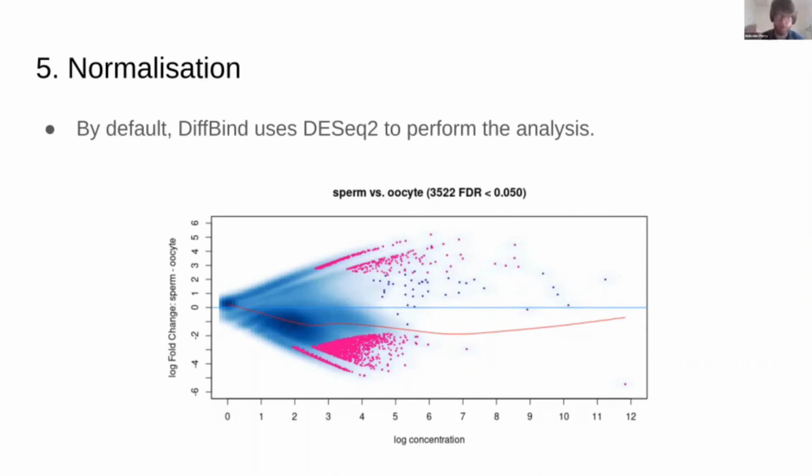And if you look at the red line, it's basically saying that at different concentrations, there are different normalization factors. And that's what's really tricky about this. In some experiments, stuff that's higher is amplified or suppressed, or stuff in the middle is too high or too low, and that kind of thing. So it is complicated, but we're lucky to have things like DESeq2 and edgeR to do this for us in a systematic way, so we can get robust results out. Again, this is all handled behind the scenes.